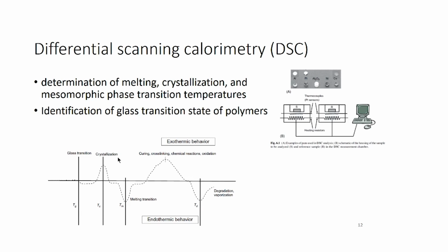These temperatures are very essential when you are using thermoresponsive gels and other temperature-involving implants and devices. It can also be used for characterizing new biomaterials where you have a cross-linked material or a mixture of two materials. There would be a shift in the glass transition temperature and a change in the melting temperature, because the higher the cross-linking, the more the melting temperature will vary.